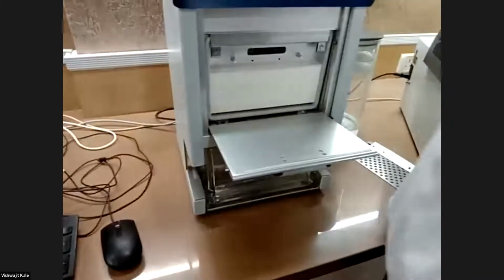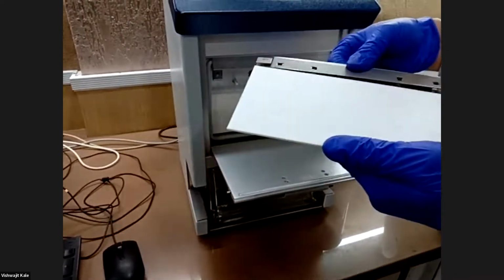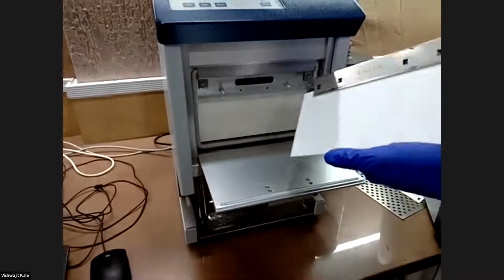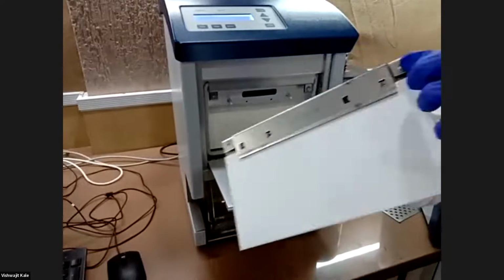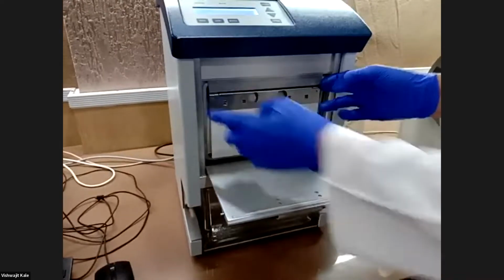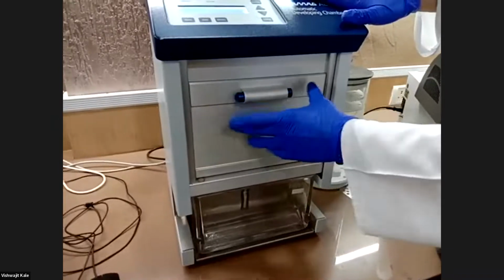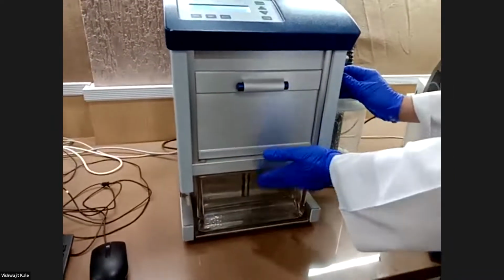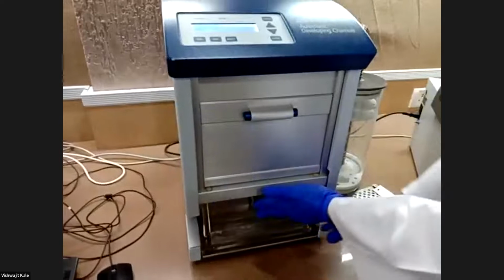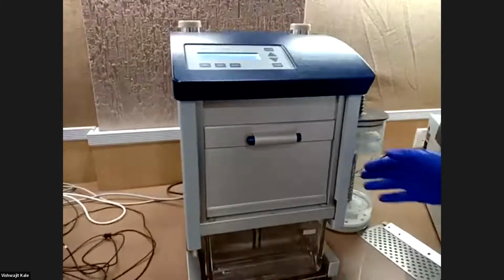If I'm using 20 by 10 centimeter plate, so this is hanger given for glass plates to hang the plate at the top assembly. So magnets are given. These magnets will automatically stick to this surface, and plate will remain at the upper portion of this ADC2. I'm closing this upper part. I have kept already twin trough chamber with saturation pad we need to keep, and we need to close this twin trough chamber from upper side with this assembly given at the top.